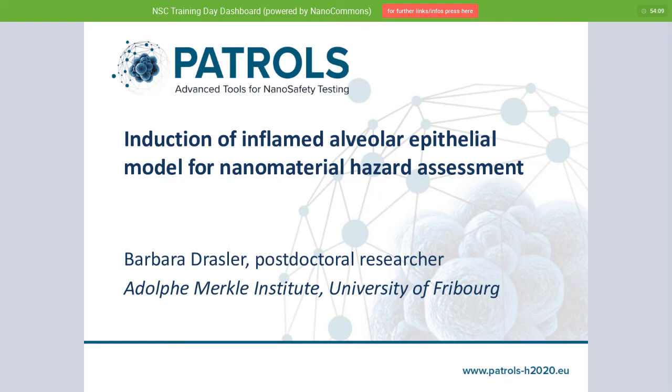All right. So thank you, Martin, for the presentation, and to you, Kirsty, for giving the introduction on the lungs and its compartments. So I will also present an alveolar model. It's a bit of a different one than Kirsty presented, and I will present how to prepare a diseased inflamed model in vitro. I come from the University of Fribourg in Switzerland, and we are also part of the Patrols project.